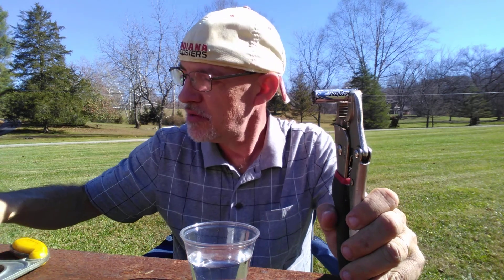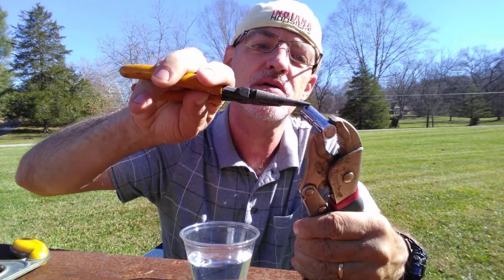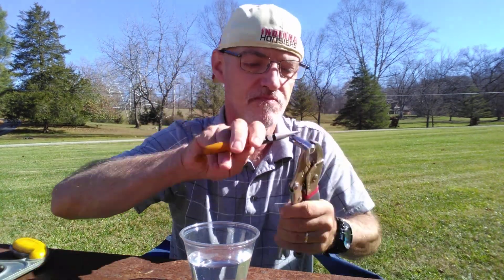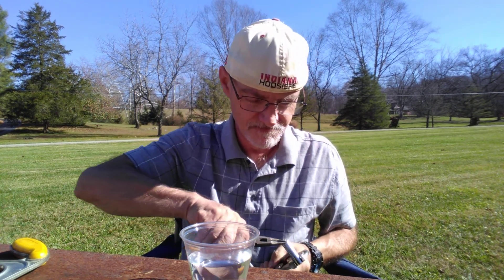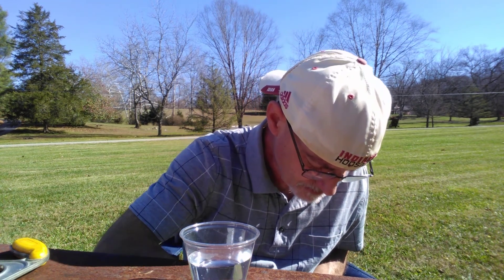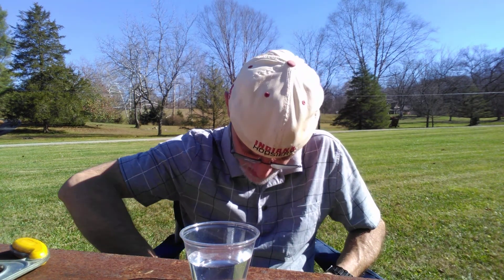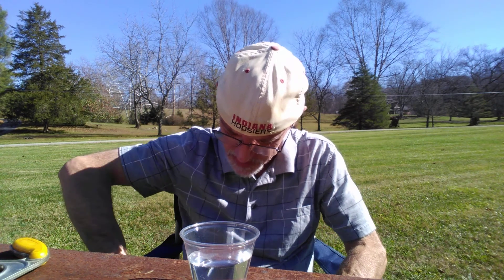So let me try to peel back — this is a little bit time-consuming at times — if I can just get a hold of a piece of the metal casing of the battery.